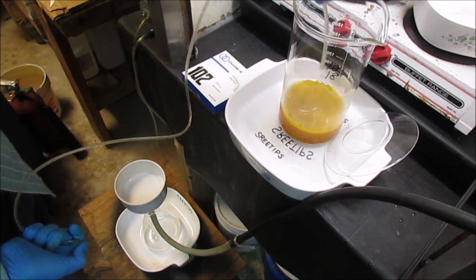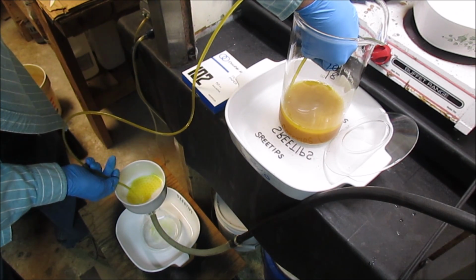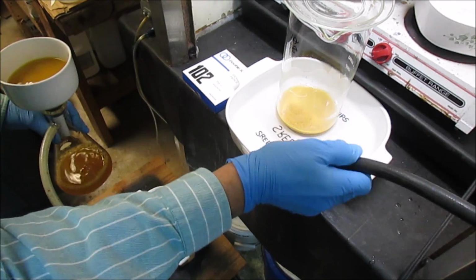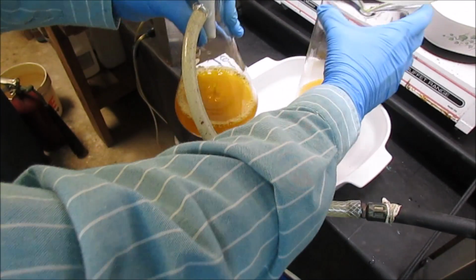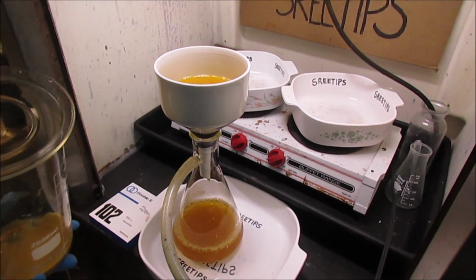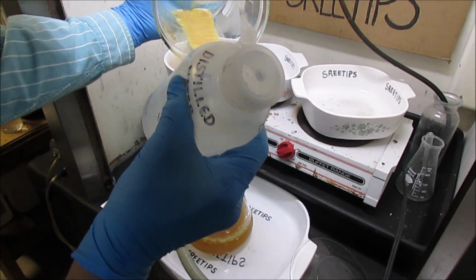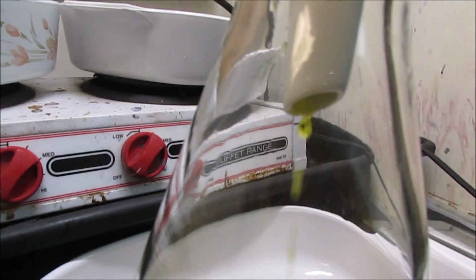Tube full of water. Filter papers in here, so that material inside the beaker there is probably just the filter papers that fell apart. Should be able to just go ahead and pour this in now. Most of the liquid is through. Yeah, I think that's just the filter papers that fell apart. Solution's running clear in there.